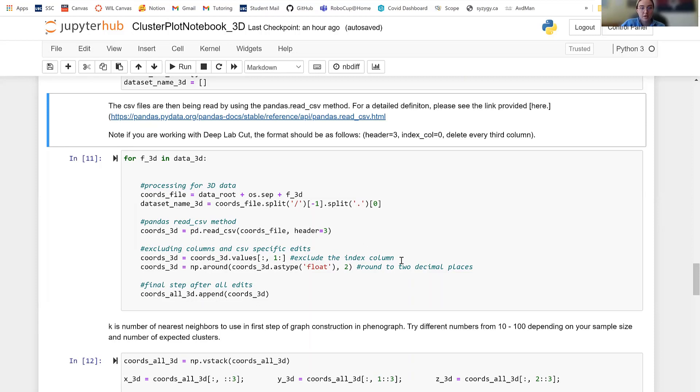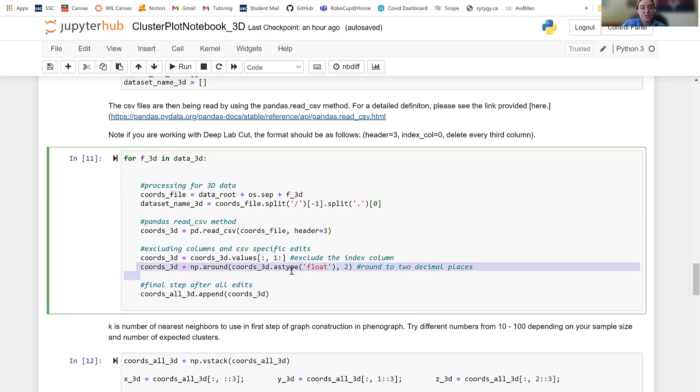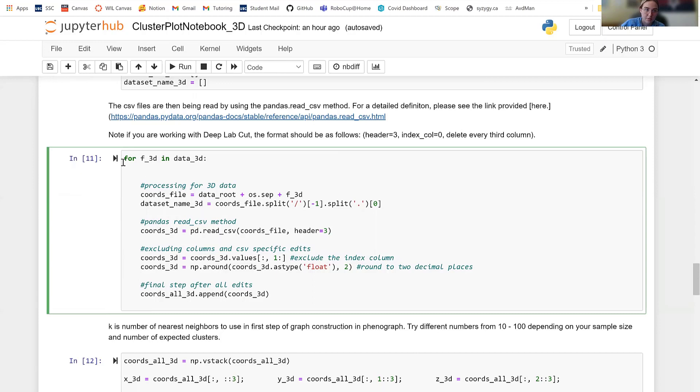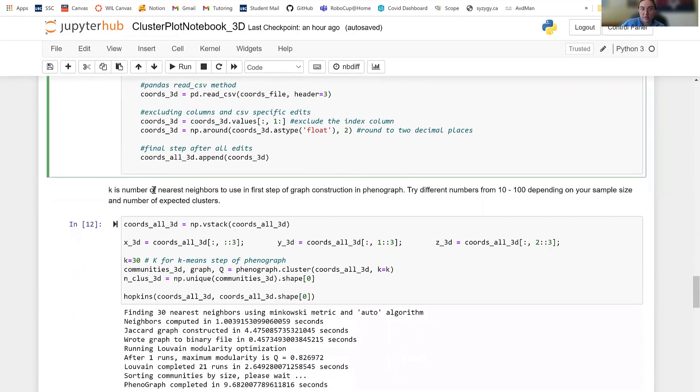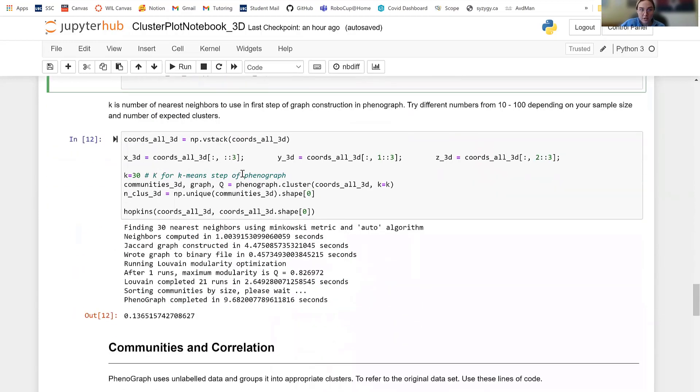Next, you're going to exclude the index column because it's not actually data that you want. But it is important for later on. Now you're going to tell the NumPy array which type of data you're reading in. So you're reading a float type. It's also very common for when working with deep lab cut to delete every third column. This is because I'm pretty sure the third column is the probability in which the object is in that area. And that's not really relevant for clustering. But anyway, so you'll run this code.